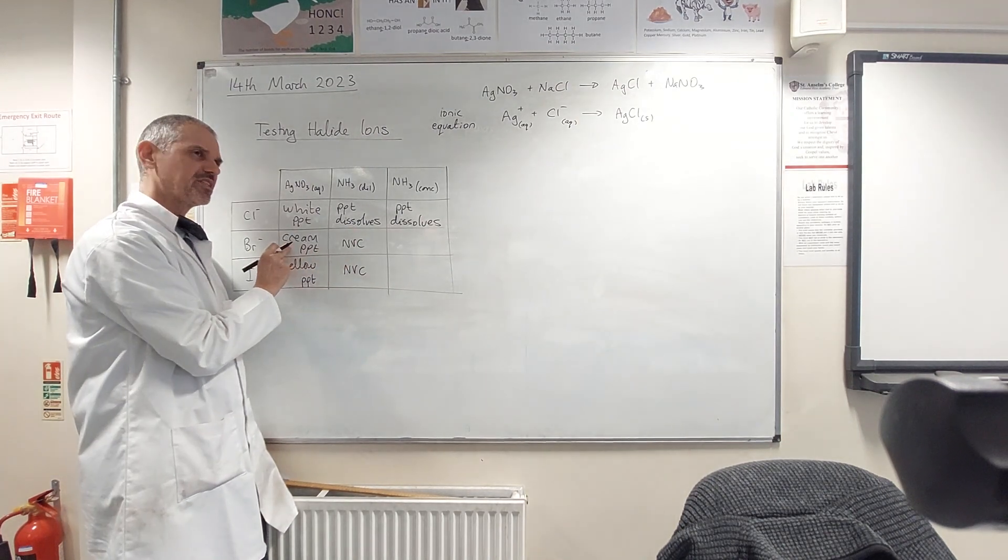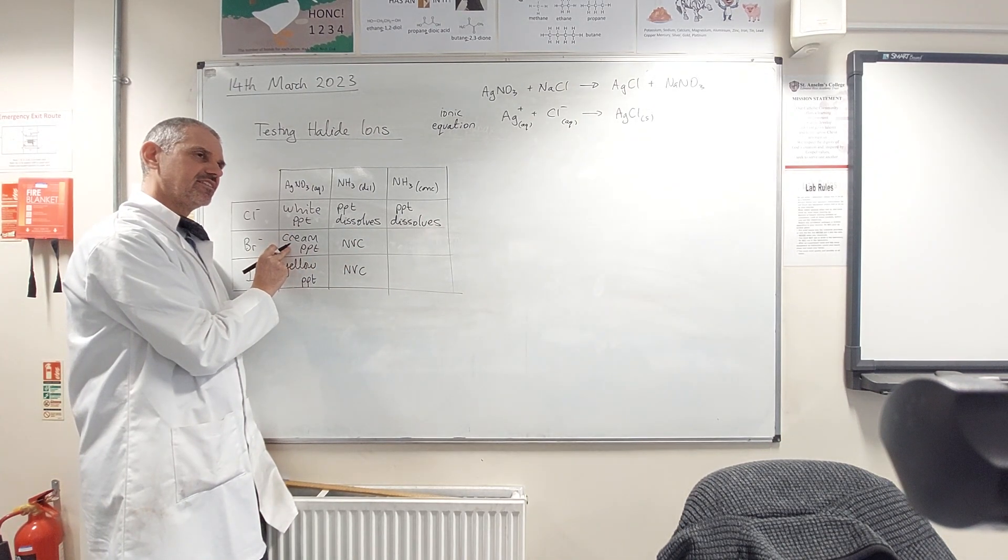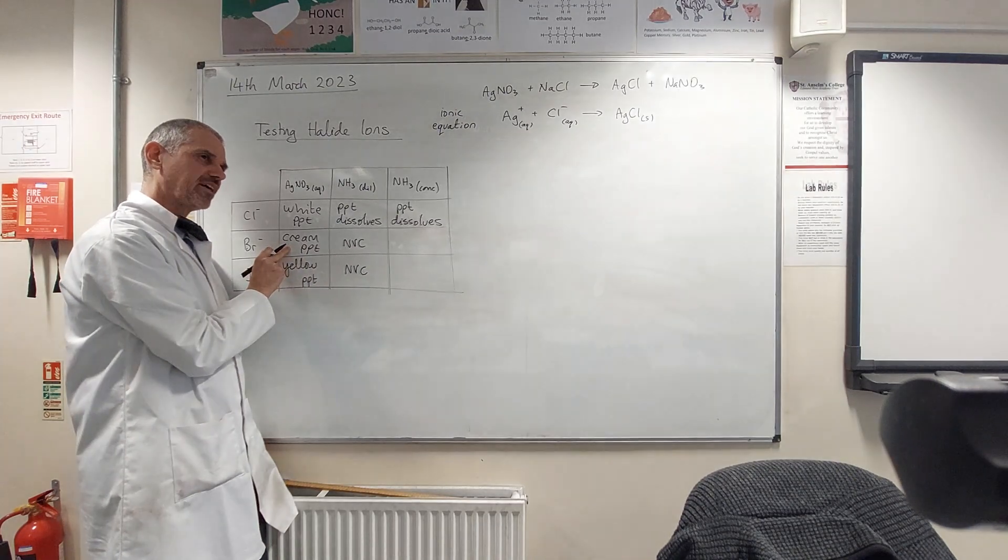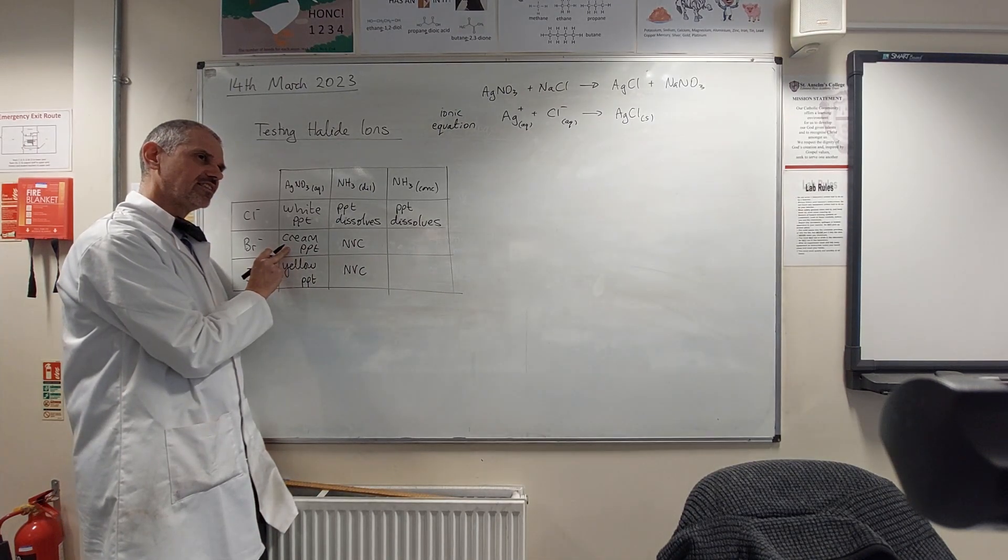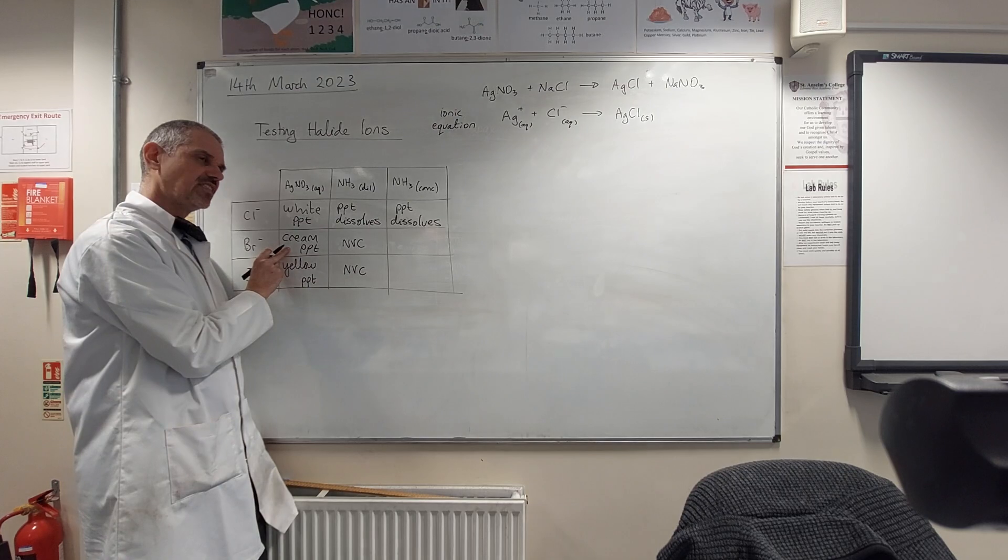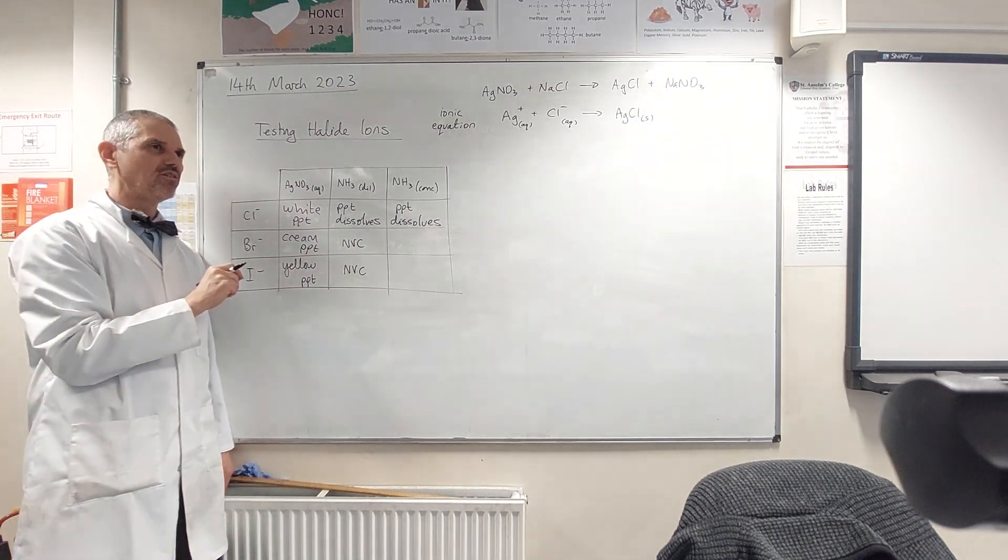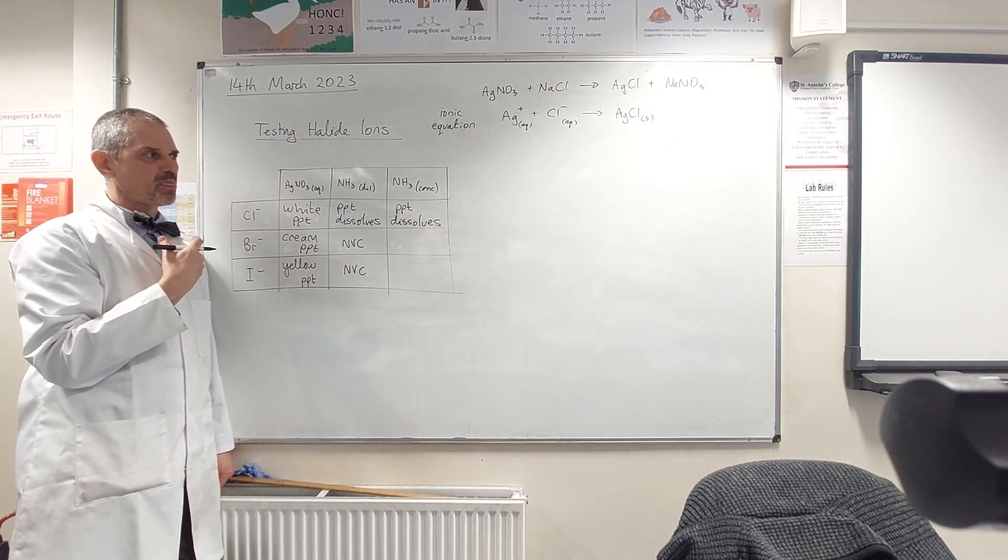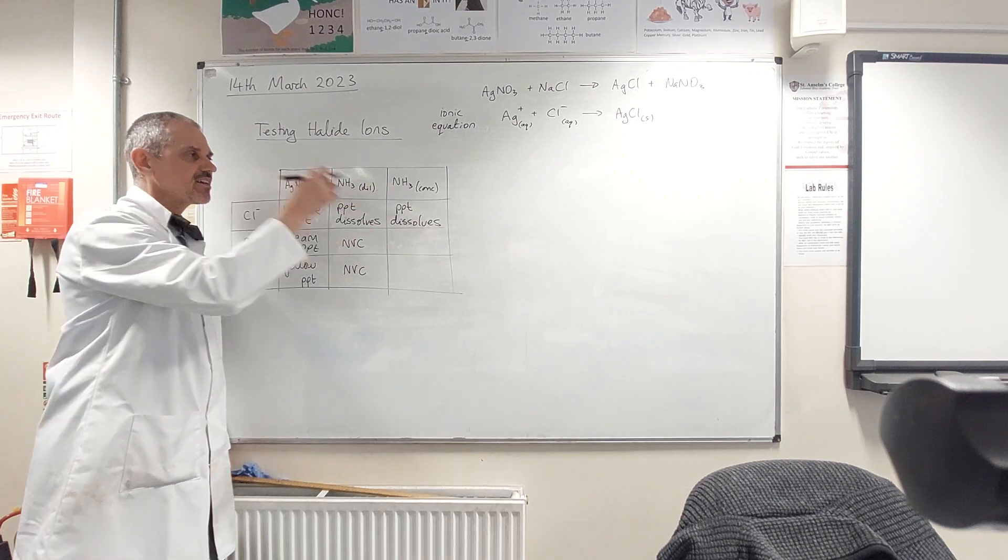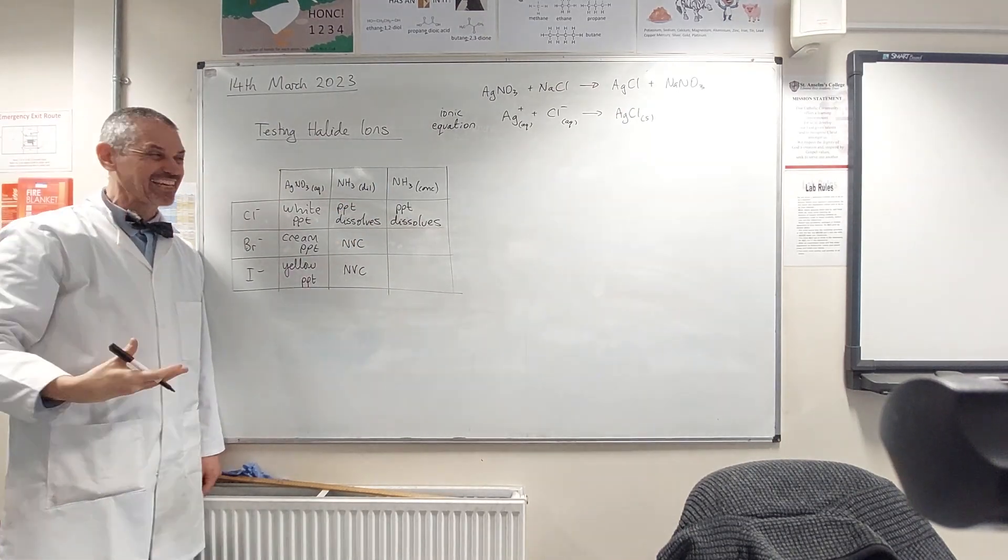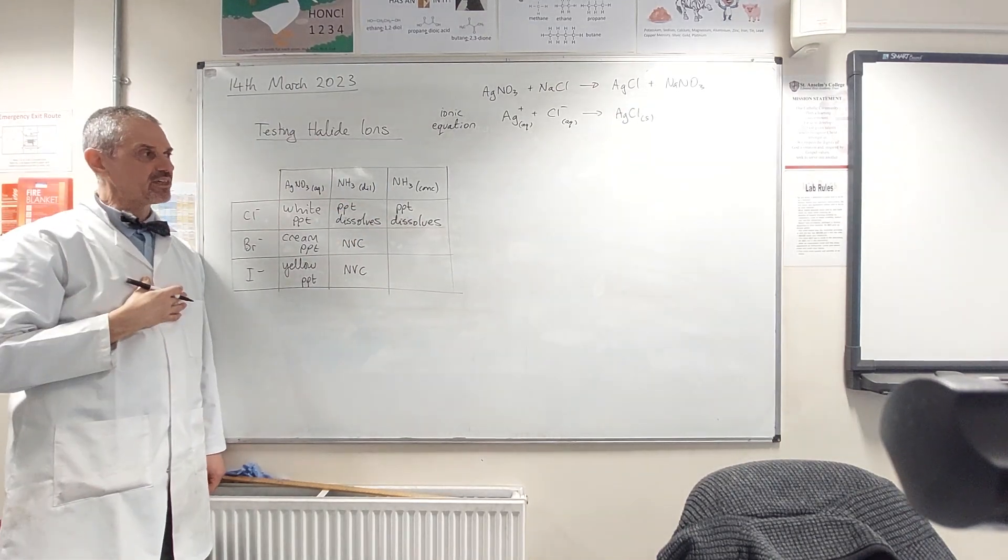No, we're adding conch ammonia to the cream precipitate. So we've got a precipitate forming because it's already there. I don't see anything else happening. Okay, we might just need to add a bit more because the reason we're adding conch ammonia is to add like an excess of ammonia is what we're looking for there.